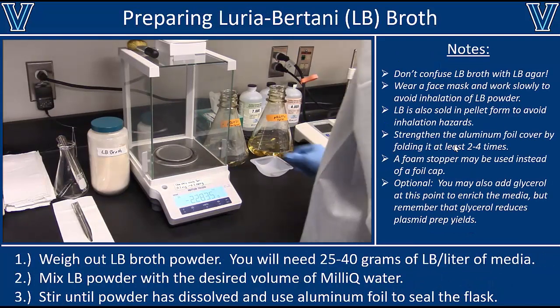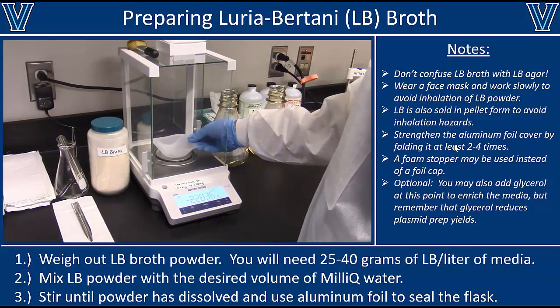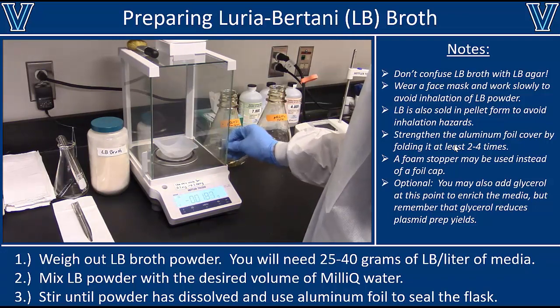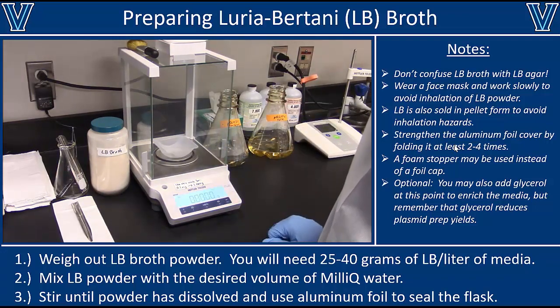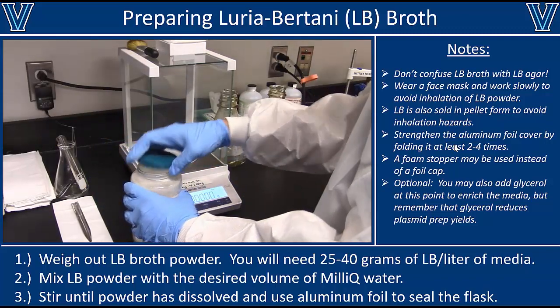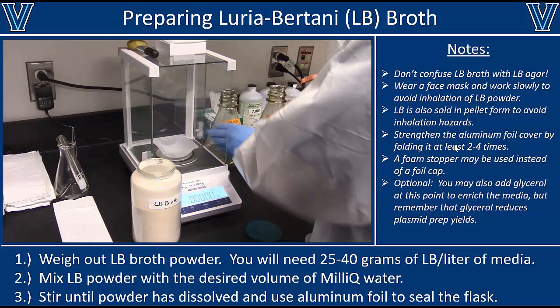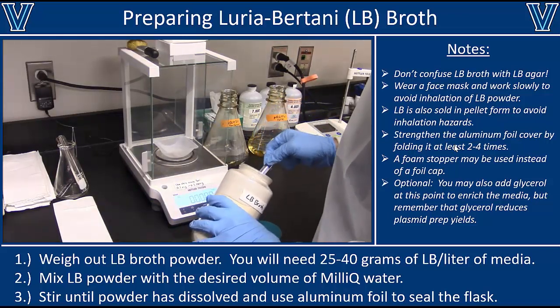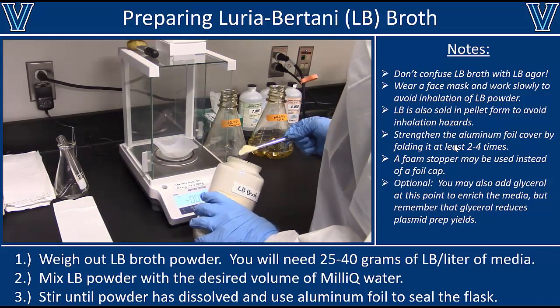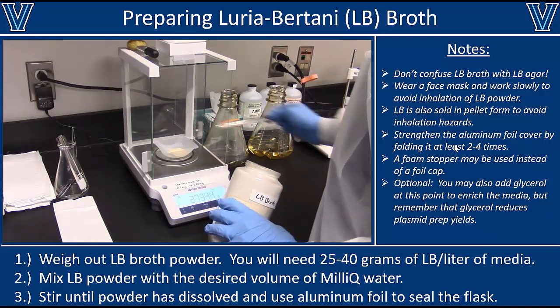Let's start off by making some media. There are a lot of different medias you can use to grow cells, and you should check to see what media is best for your specific type of cell. E. coli bacteria are usually grown in Luria-Bertani broth, or LB broth, which you can make from scratch by mixing together yeast extract, salt, and tryptone.